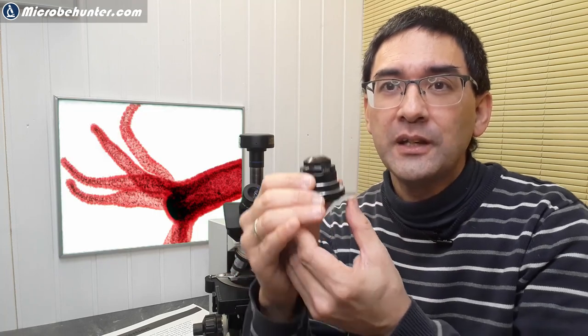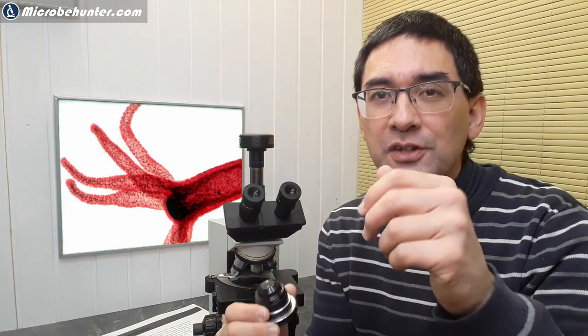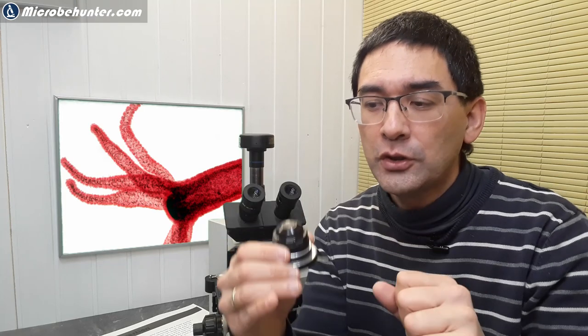When you're opening and closing the condenser like this, you're not focusing it. You're just changing the diameter of the aperture. Focusing the condenser is done by raising and lowering it, and there is a knob that you can turn to actually raise and lower it.